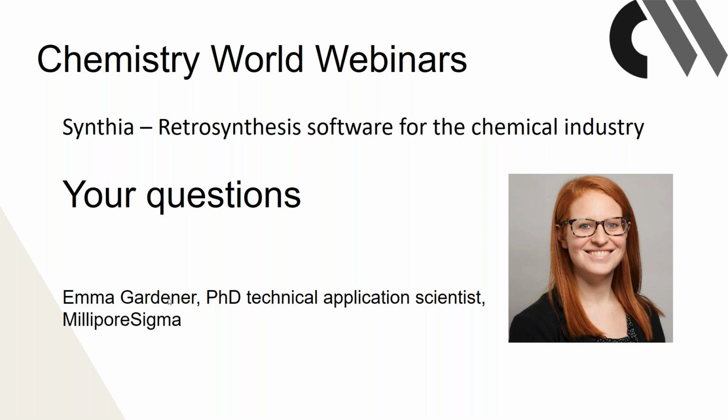I guess another place machine learning could come in handy would be to keep an eye on the literature. You talked about using machine learning to strip rules from the literature, but it could also just be used to flag up to you when you may need to review the rules for any given path or any given reaction. Yeah, that's a good idea, of keeping track of that. I'm not sure if that's something that we're doing, but that would certainly be a useful application.